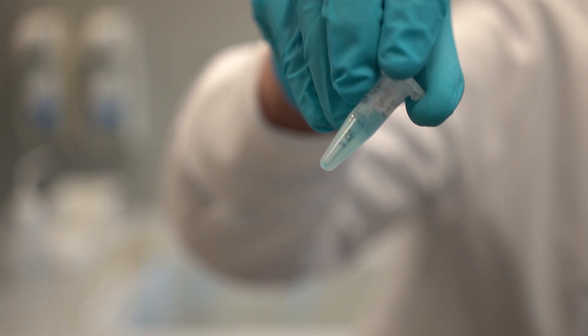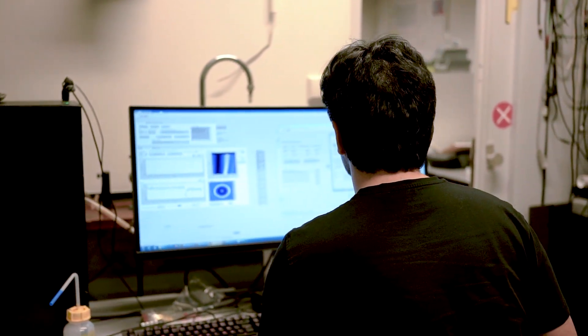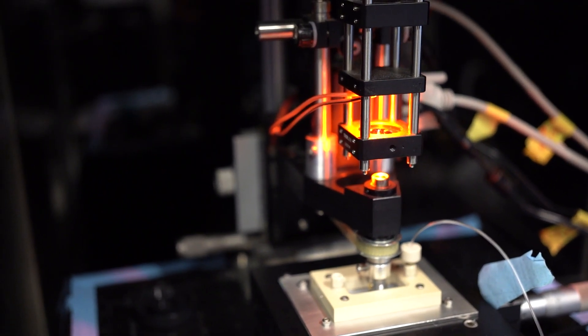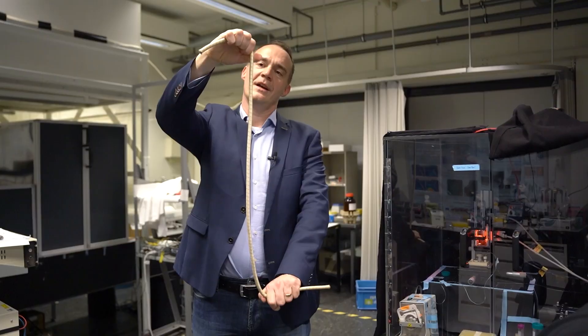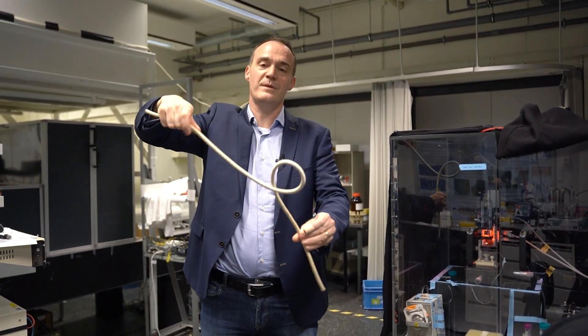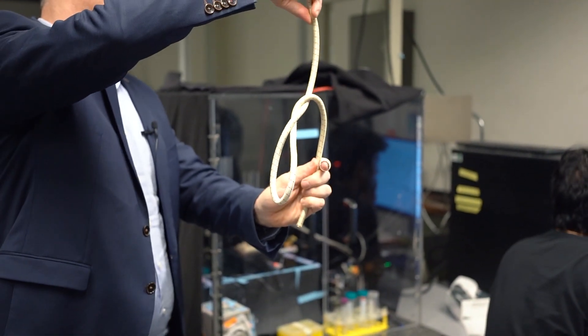Now we're going to go downstairs into the basement. I'll show you how we study DNA using single molecule methods. This is a so-called magnetic tweezers instrument. Here this small silver part — there's a pair of magnets and as you can see they can rotate, and we can also move them up and down. What we can then do is actually stretch the DNA using external magnets, and we can also twist it, and this will create DNA supercoiling, which kind of looks a little bit like this.